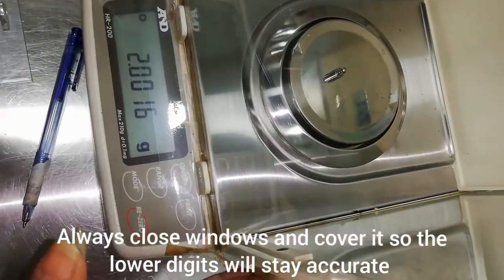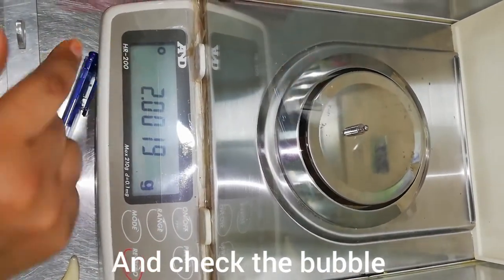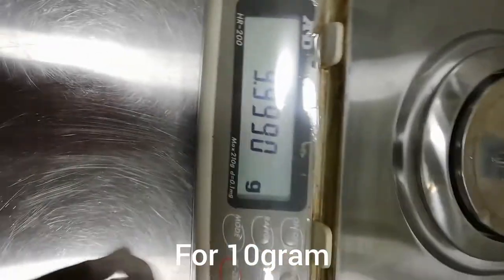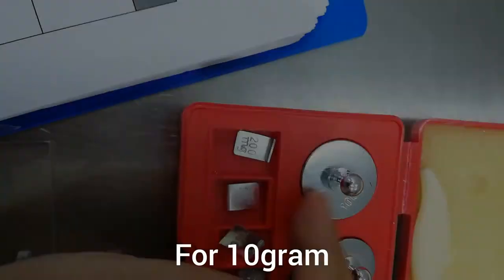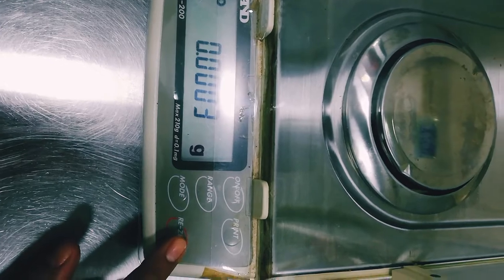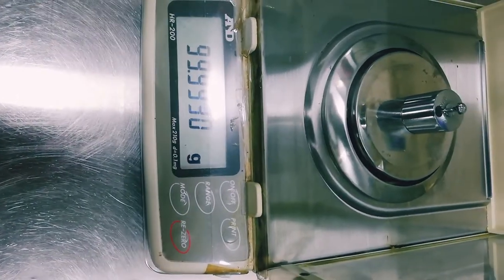Always close the window or slides of your analytical balance so you get accurate results. Also check the circle on the screen — it shows a bubble that should be in the center. There is a bubble on the left side or back side of your analytical balance, and it is a sign of the accuracy of your results. This is for 10 grams, and this one is for 100 grams.